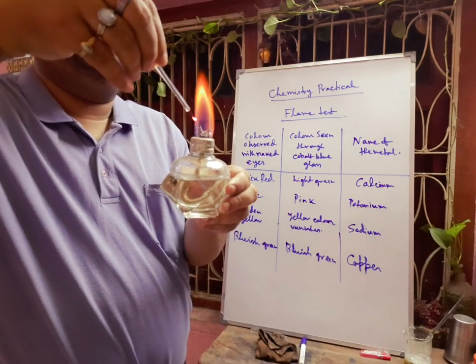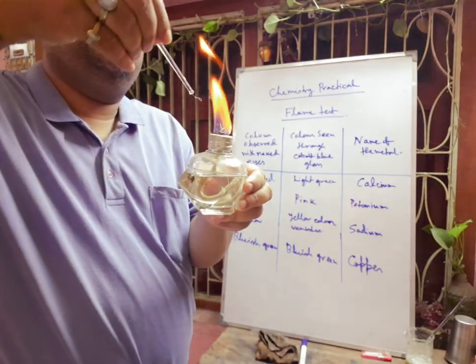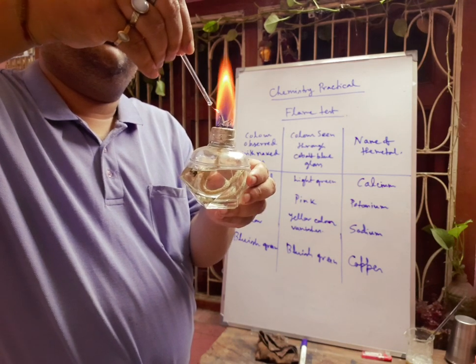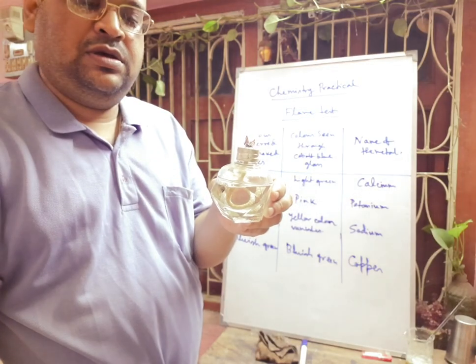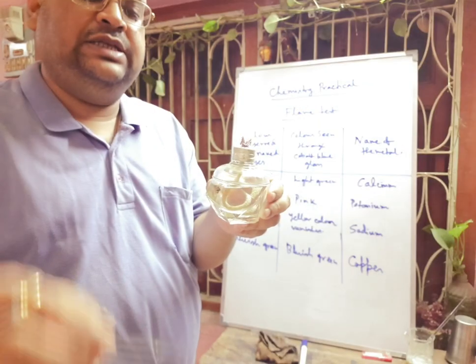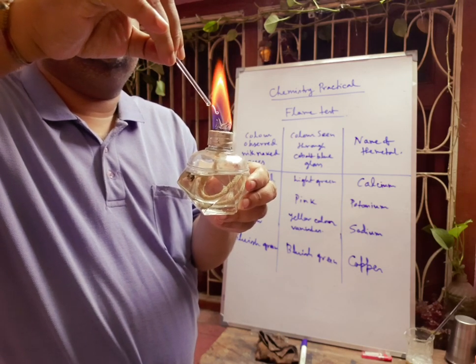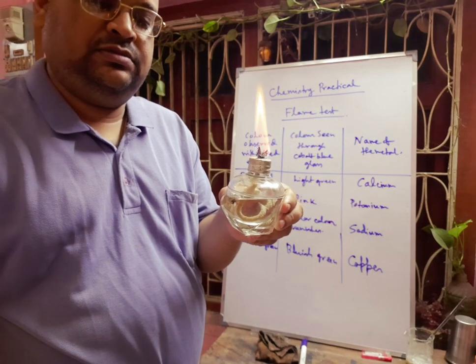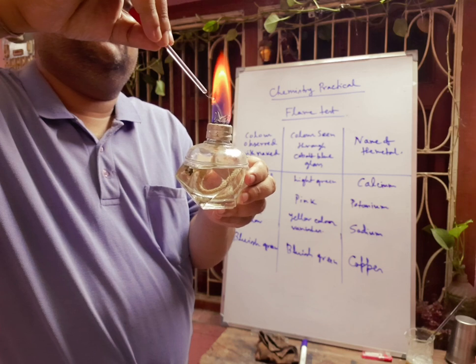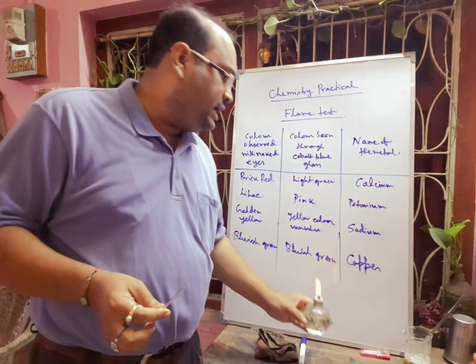Brick red color is coming and going, and by this test you can easily identify calcium. Again, you can see the color coming and going. In this way we can easily detect calcium.